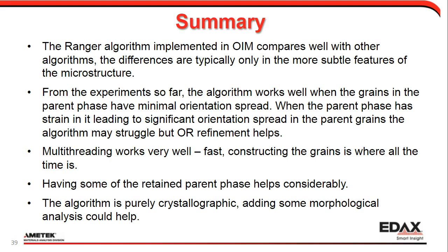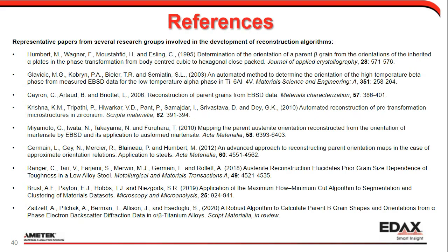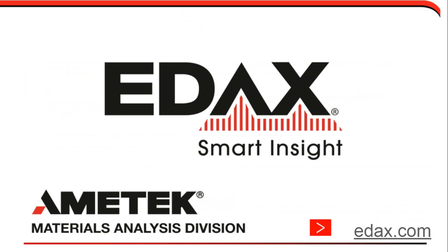And like I said at the beginning, this is work that's been going on for quite some time. There have been a lot of good papers, and I've relied on some of that work. I just wanted to give representative papers from several of the research groups that have been involved with this, and thank them for their pioneering efforts that have helped us get to where we have something that is commercially available. And I hope convenient, as it sits within OIM and you can work with the same data sets and the same workflows that you're used to. I'm pleased to see so much work in this arena and hope that it continues and we can improve it even more in the future. So with that, I will close, and thanks for listening in.